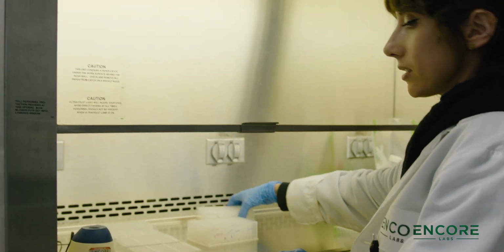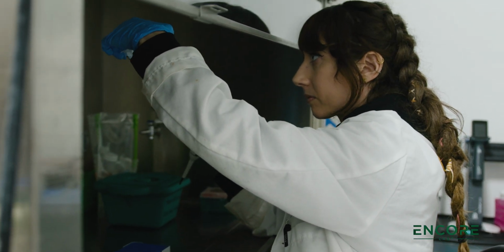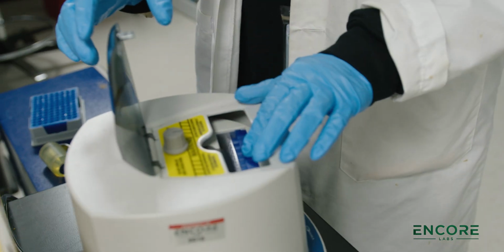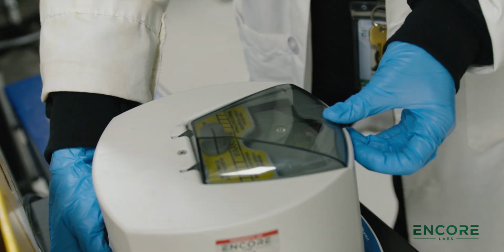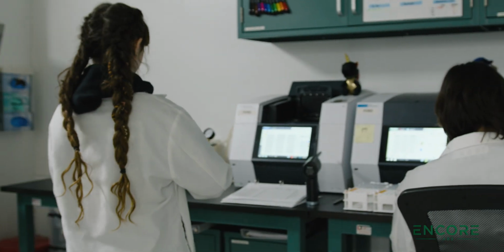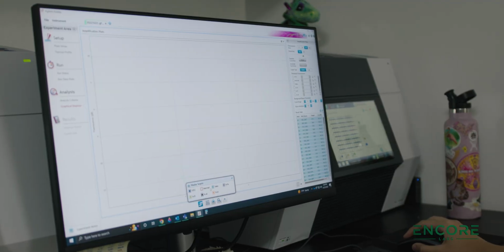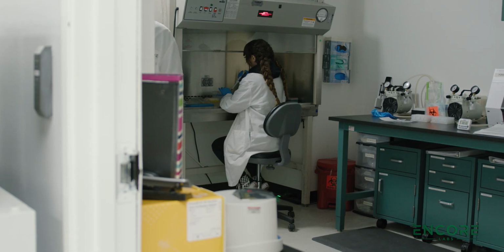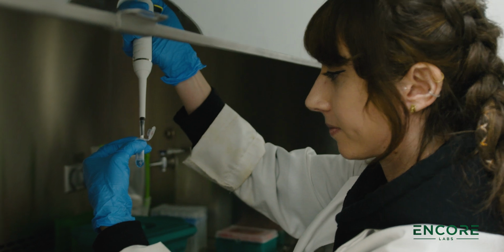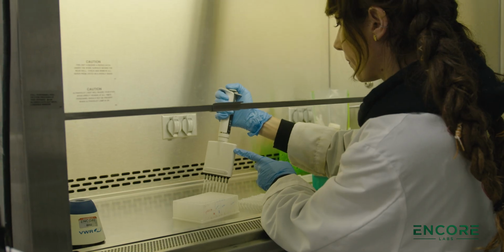So a simplification of what we do is extract DNA from our sample and then run it through PCR. If you think you don't know what PCR is, think again. With COVID testing so prevalent this year, your own sample has probably undergone PCR to see if you were positive for the coronavirus. However, in our micro department, we don't test for viruses, but instead for 2 types of bacteria, Salmonella and E. coli, and 4 types of Aspergillus molds.